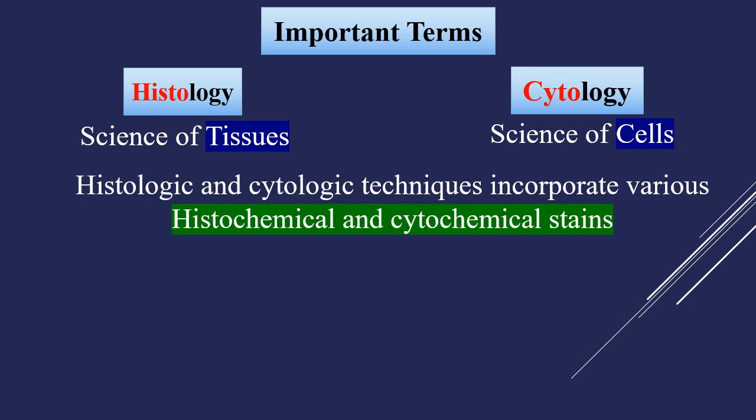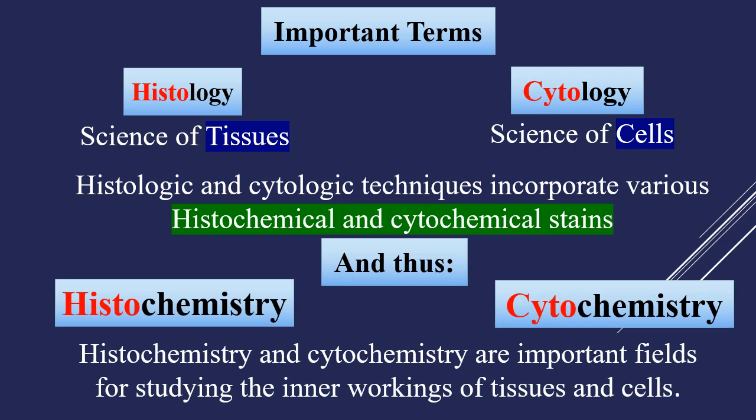Both histologic and cytologic techniques incorporate various histochemical and cytochemical stains, and thus we must know that histochemistry and cytochemistry are very important fields for studying the inner workings of tissues and cells. So let's know more deeply these fields of biology.